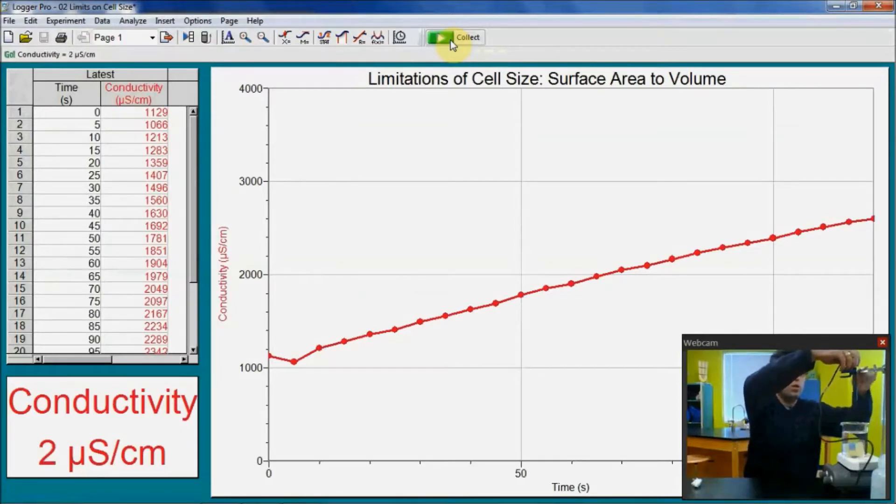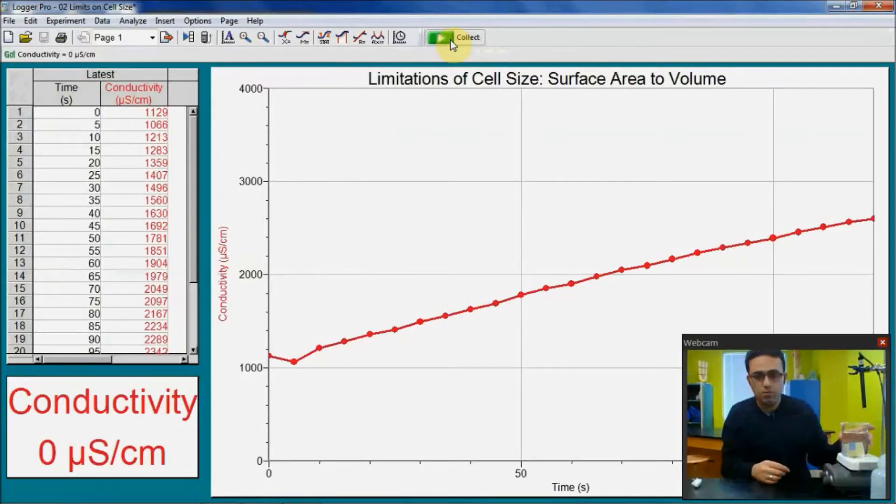So before I go ahead, I will not do the further steps though, but before you go ahead in the further steps, you dump everything away. And then you rinse the beaker well, put new distilled water in it, and you get another agar cube divided into eight pieces. Put all the eight pieces in the beaker and start the process again. When you are done with the second step, empty everything out, set everything again. Get another agar cube divided into 64 equal pieces. Place all the pieces in the distilled water and start the process again.